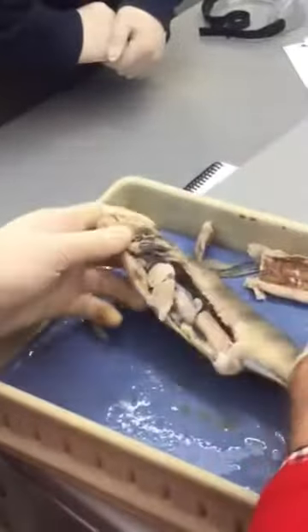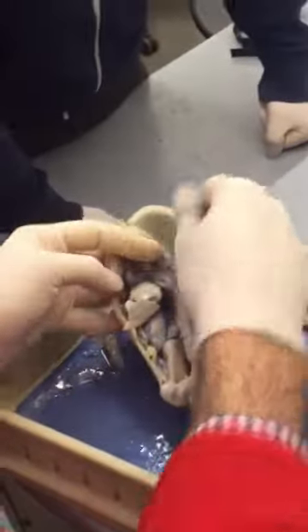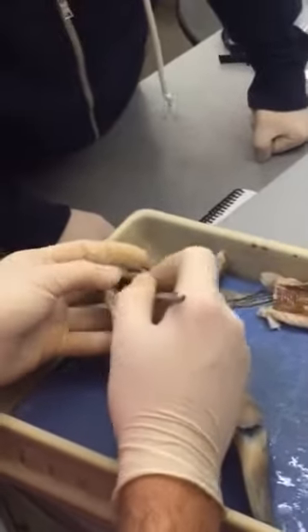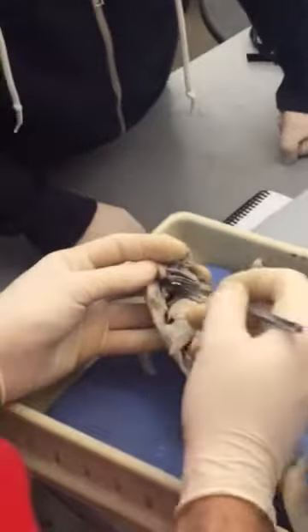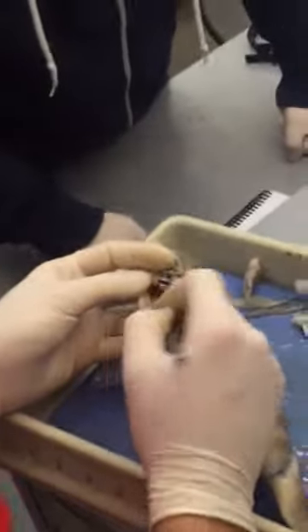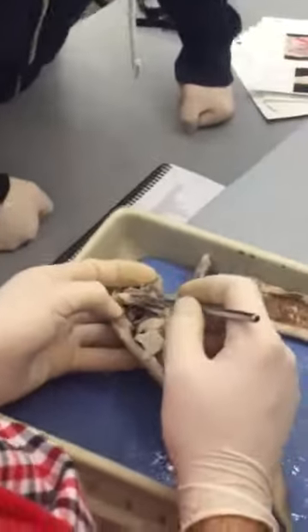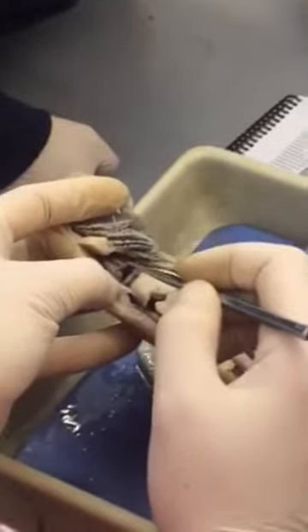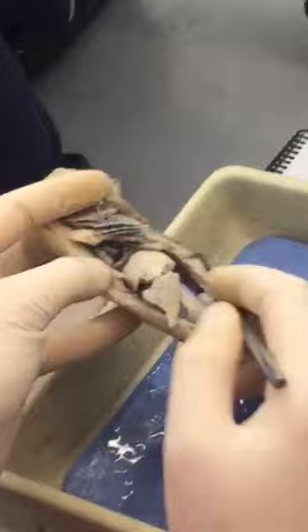You can actually see the heart very clearly here. Look at that — the darker one right there. So it's the darker bit — the darker one is the liver. See that, guys? Okay, all right.